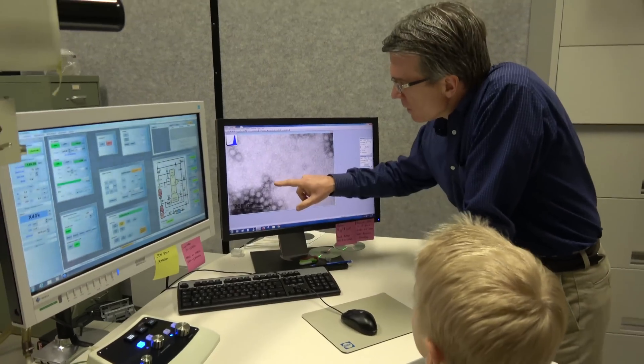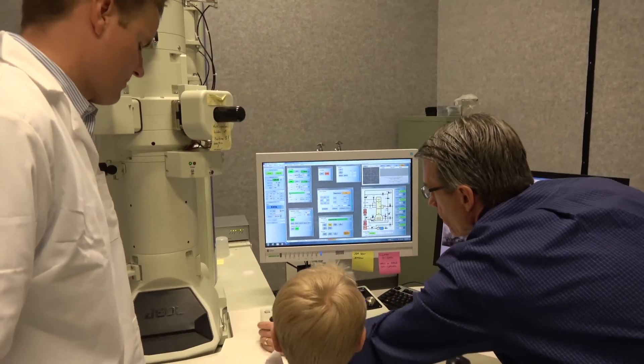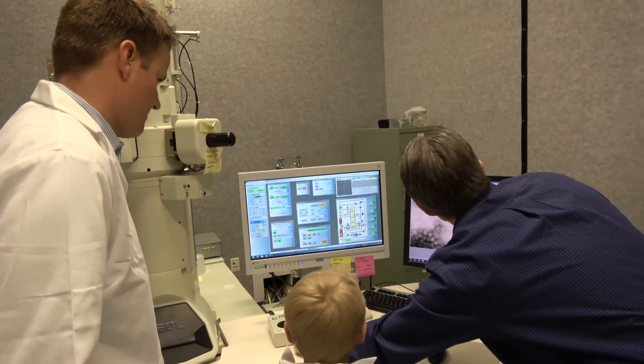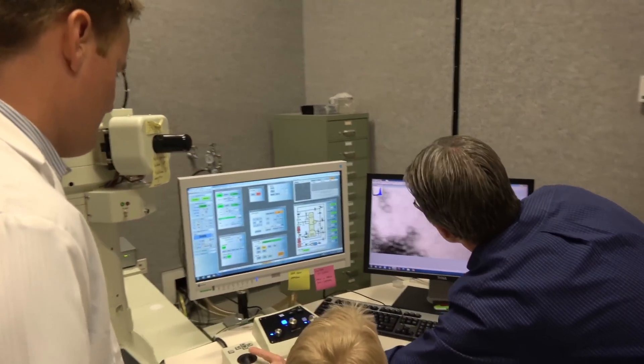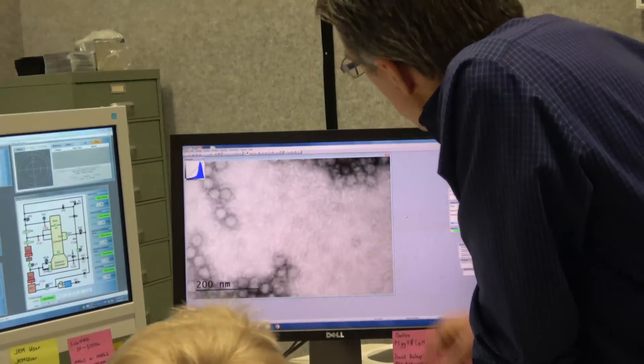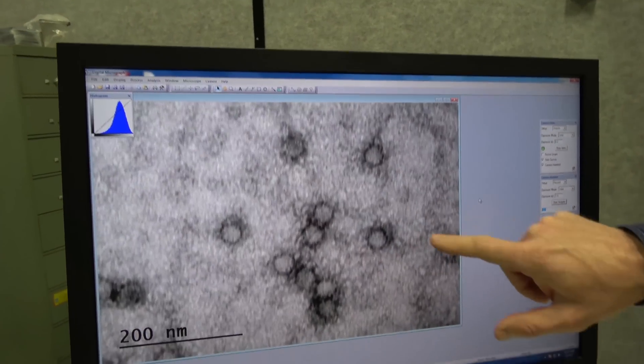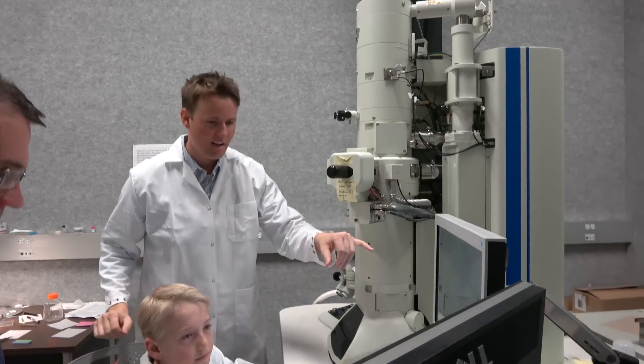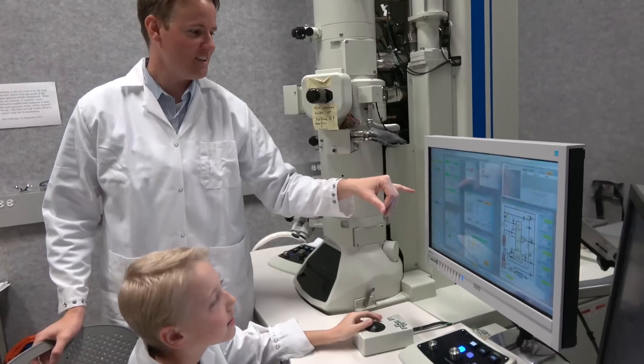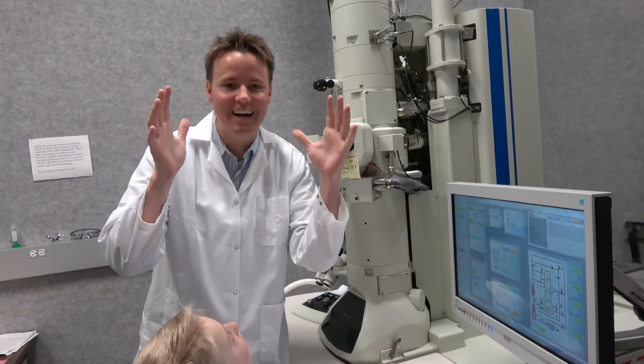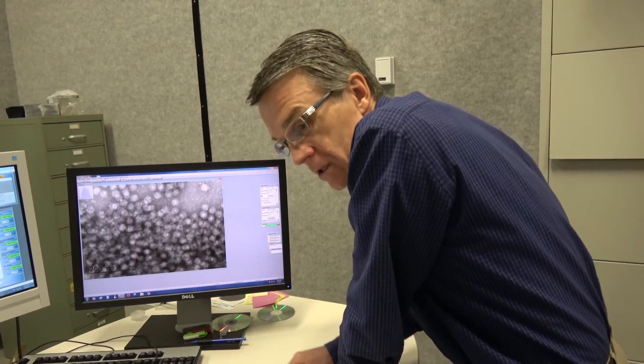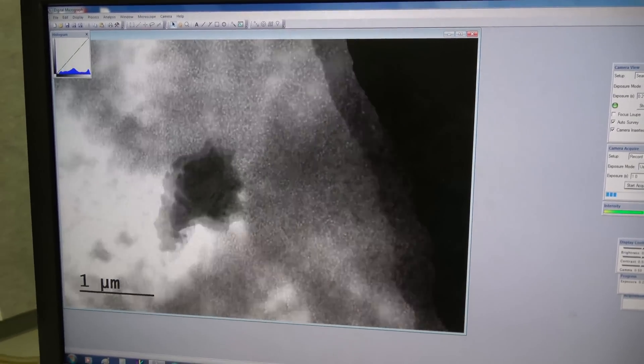Each one of these is one virus. Probably played with a trackball, right? So let's move around and see if we can find some others. Yeah, that's cool. And we are looking at the actual virus at how many times? Forty thousand times.